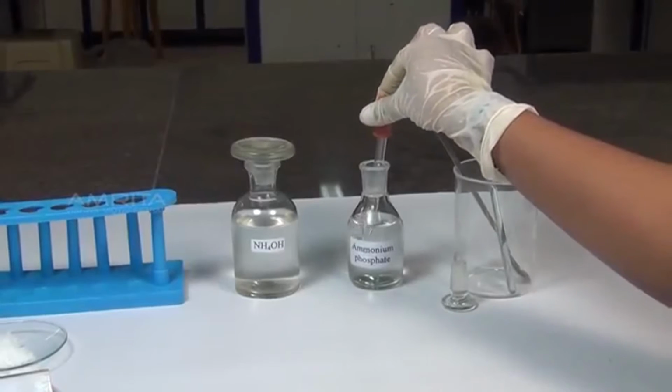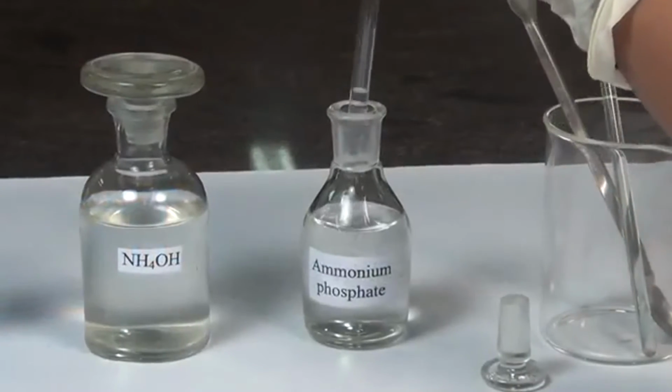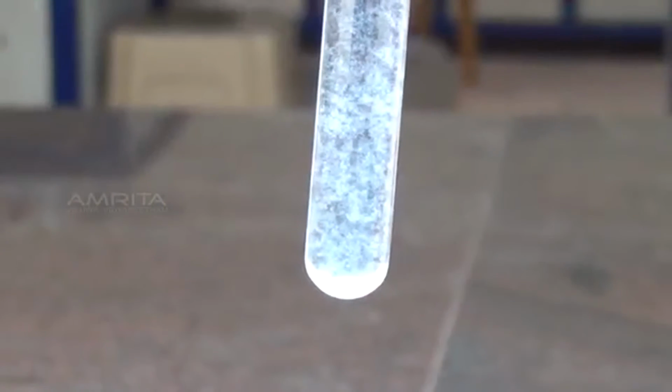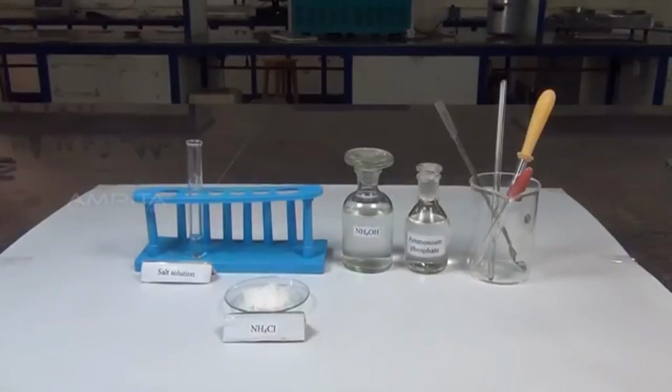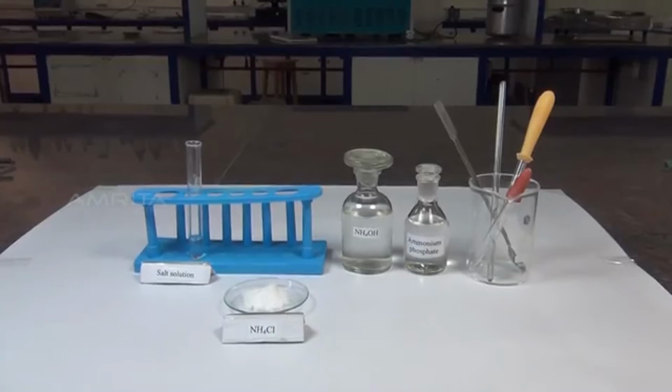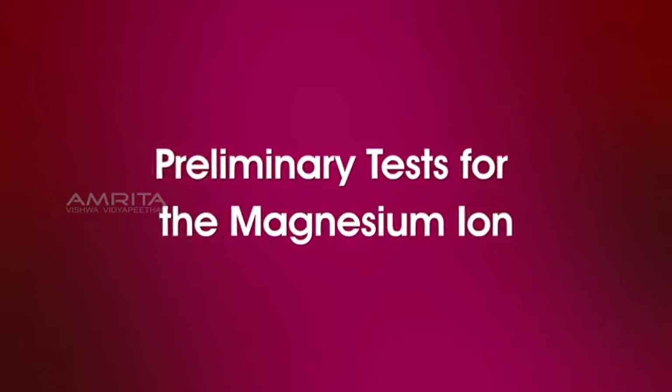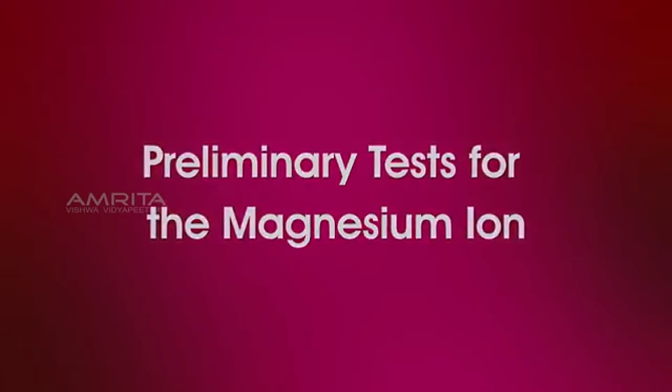In group 6, magnesium ions form a precipitate of magnesium ammonium phosphate with ammonium phosphate solution. Our aim here is to test for the presence of the magnesium ion in a given salt. First, we look at the preliminary tests for magnesium ion.